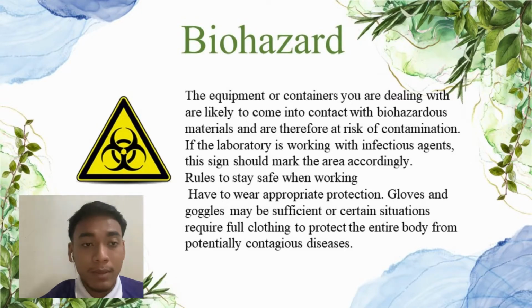The last symbol in the lab is biohazard. The equipment or containers are dealing with, or likely to come into contact with, biohazardous material and are therefore at risk of contamination.